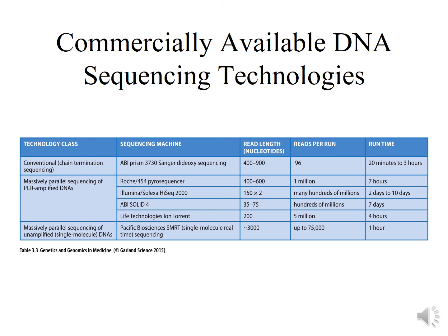Commercially available DNA sequencing technologies. In the early to mid 2000s, new sequencing by synthesis methods were developed that could record the DNA sequence while the DNA strand was being synthesized.